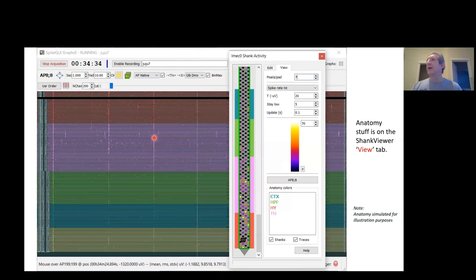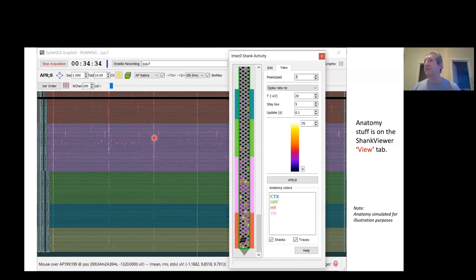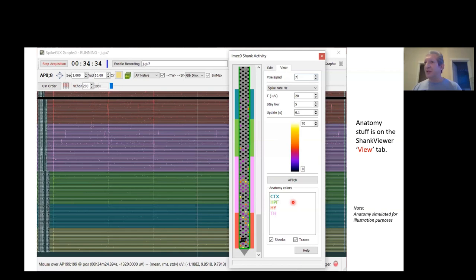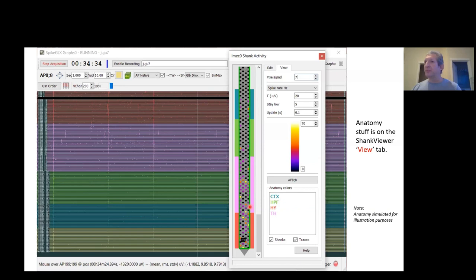I want to talk about the anatomy stuff for just a second. Pinpoint and Trajectory Explorer both can send anatomy information to SpikeGLX. To make that work, you want to be running a run with the graph window open. Click on the shank viewer, and then it's on the view tab of the shank viewer that you're going to see the anatomy information. You'll have a legend box that shows the regions that are being sent to the software, the names of the regions, and the colors that they have. Click on the shanks checkbox when you want to colorize your probe according to that data. Click on the traces checkbox to colorize the traces in the graph window by that information.